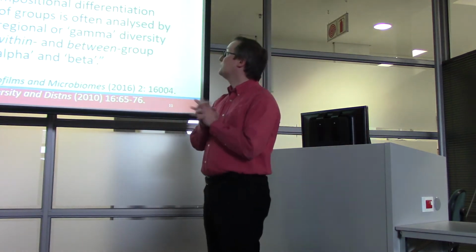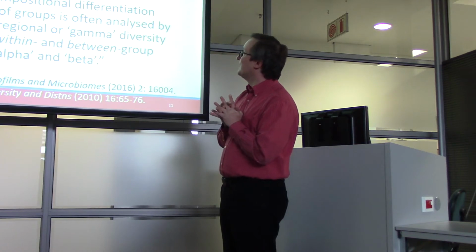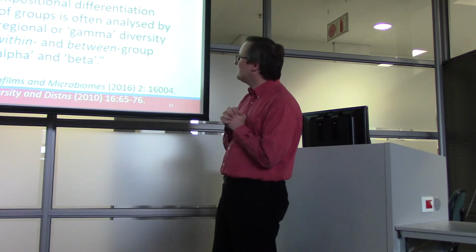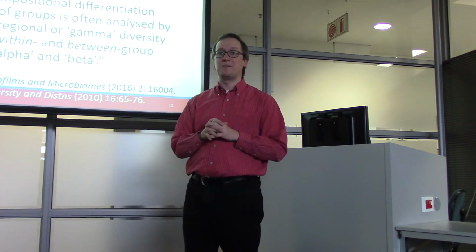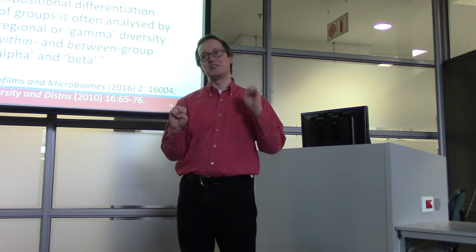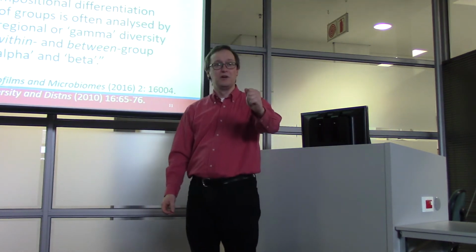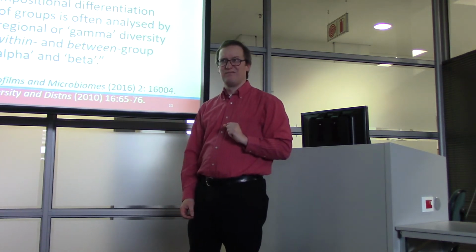So, what is an OTU? It is an operational taxonomic unit. It is a cluster of similar sequences, usually within 97% similarity of each other, represented by a single consensus sequence. And now I've put in really sloppy language at the very end of this, and I want you to be aware that this is how most people think of it, and it may not actually be that accurate. But we think of one OTU as representing one species. Sort of.